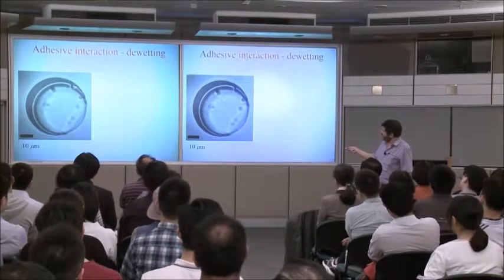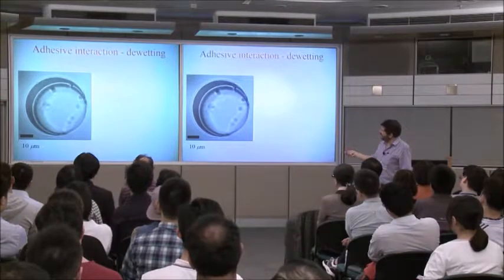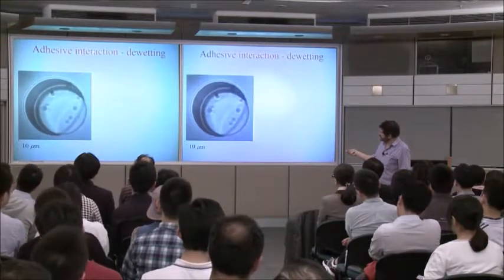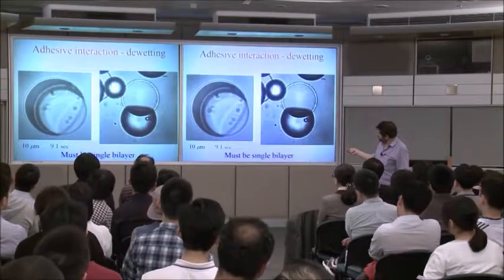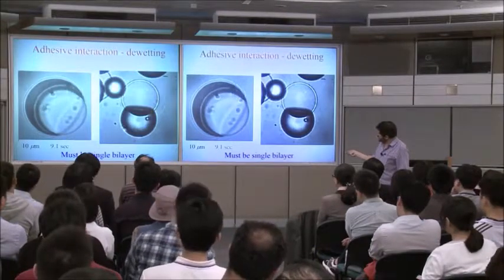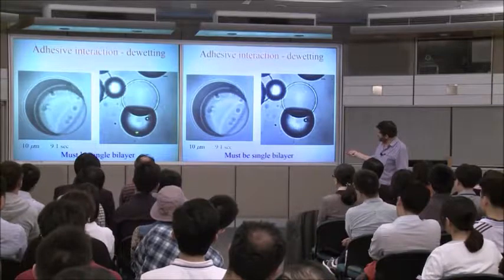It's actually interesting to watch what happens. This is what happens as the solvent evaporates. This is just a series of images. See what's happening? I show it here. This is the bilayer structure, and this is the solvent evaporating. This will eventually evaporate.